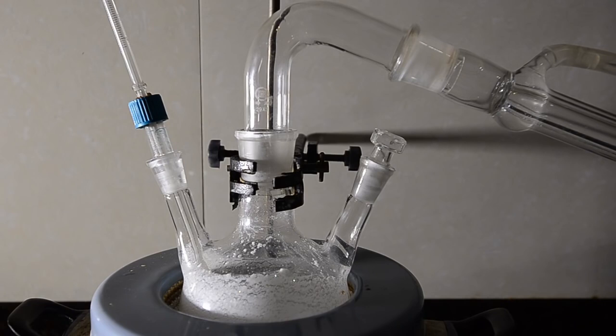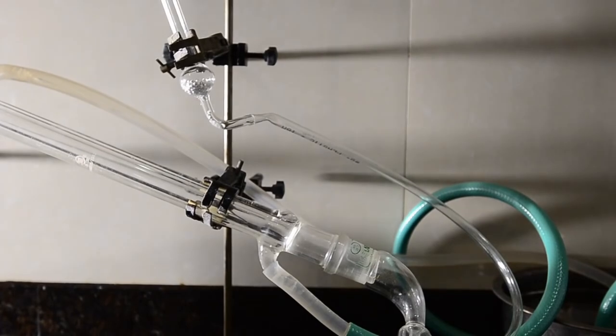Now set up for simple distillation. We're going to distill off all liquid so a thermometer in the still head isn't necessary. We've used a calcium chloride drying tube to protect the distillate.